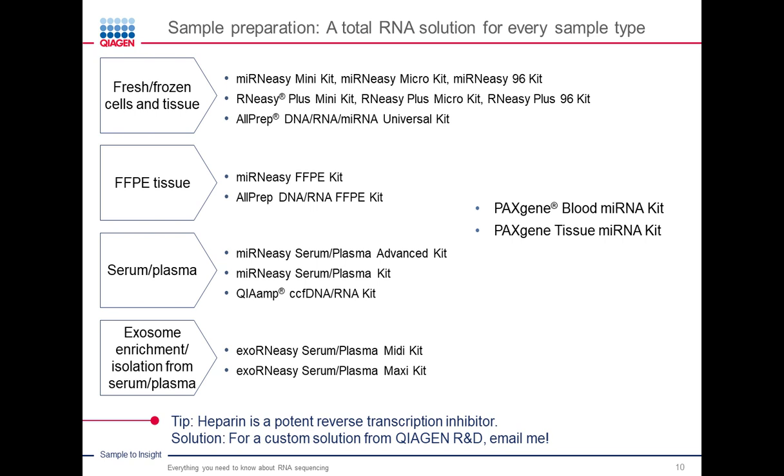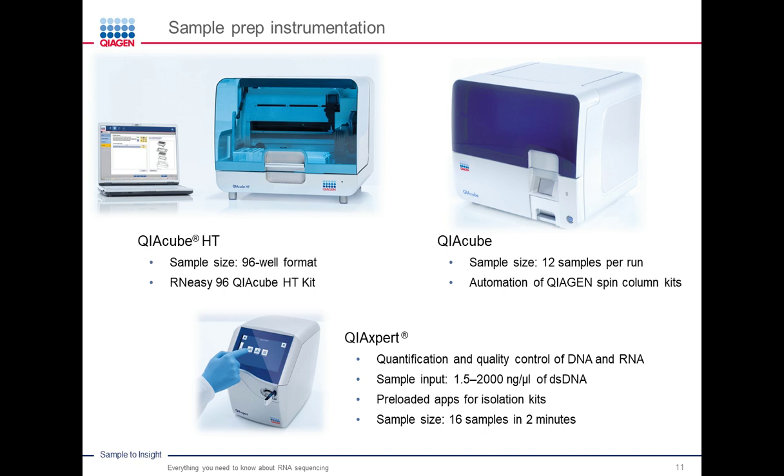Basically, you get the cleanest library that you could ever imagine, basically because there's no library there. And in response to this, we have developed a solution to remove heparin from your RNA samples. And if you're interested in this, you can ask a question about this, or you have my email address through the slides, and feel free to email me and I will send you the protocol.